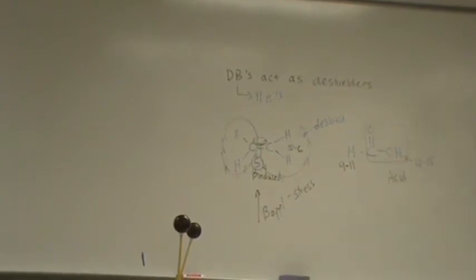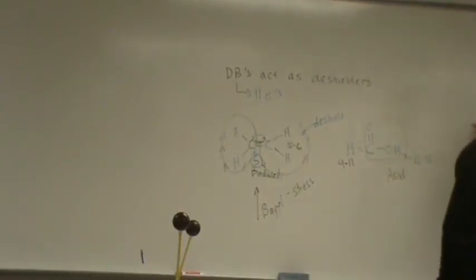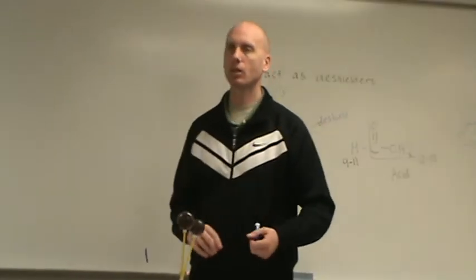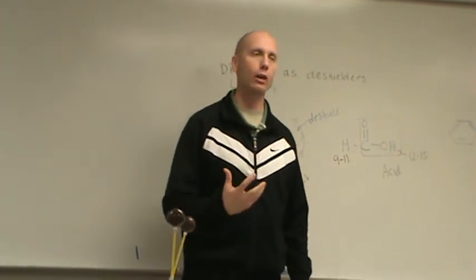Let's look at one last one, and that is the benzene hydrogen, or any aromatic hydrogen.